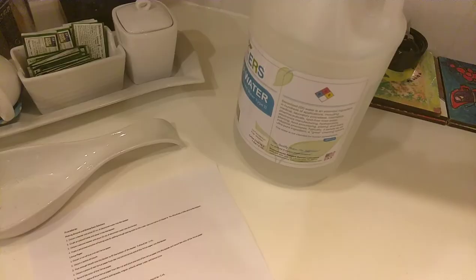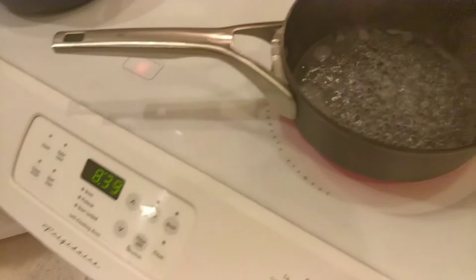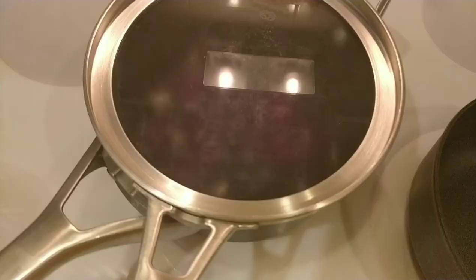Now I'll move on to making the cabbage indicator. I've poured the deionized water and it's starting to boil. Here I have the chopped red cabbage. Once it comes to more of a boil I'll pour it over, and I'll set a timer for 10 minutes. Now that the water is boiling I'll pour it over the cabbage. I've set a timer for 10 minutes.